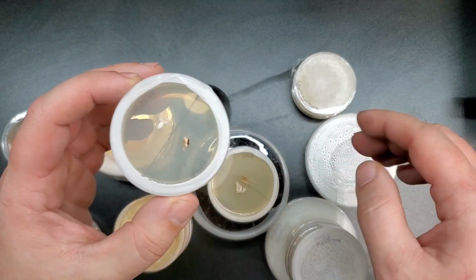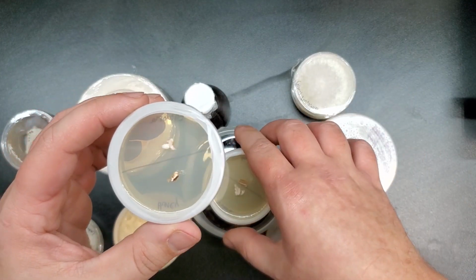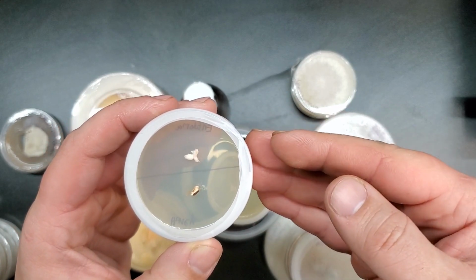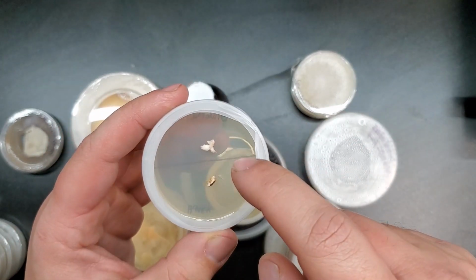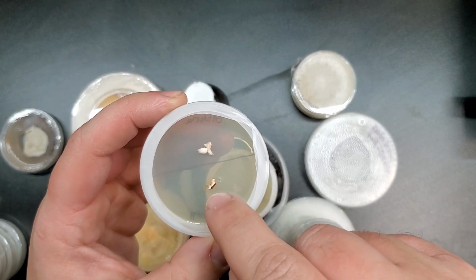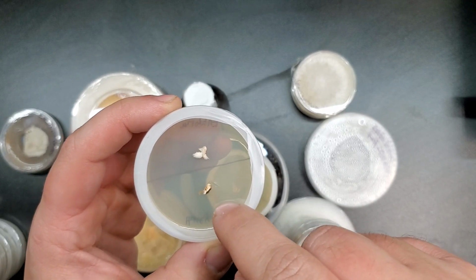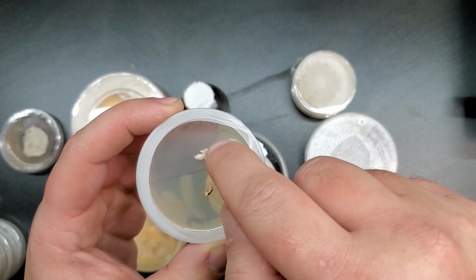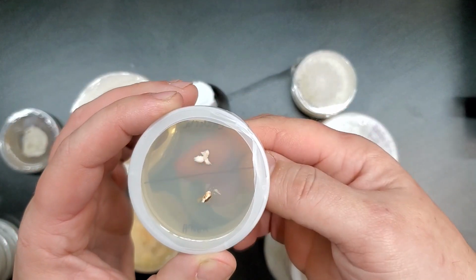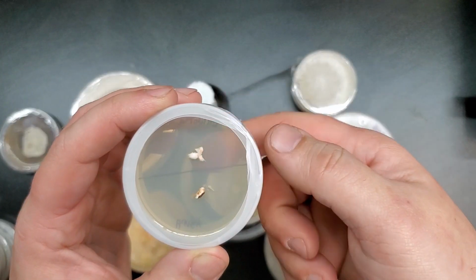These are 4. I won't show you all of them because they're all exactly the same, except for the spacing of the tissue samples. But these are 4 mushroom samples taken from the aborted form of the Entoloma abortivum and some of the honey mushroom, the Armillaria tissue sample, put on the same culture plates. So we have Entoloma tissue sample here and honey mushroom tissue sample there. And I drew a line on the bottom of the petri dish, and I labeled which was which so that I could keep track of them easier.